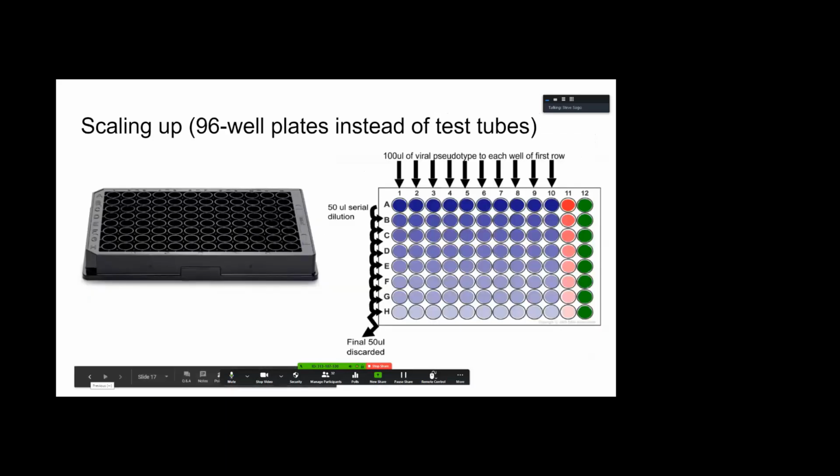So the problem with PCR, as I called it, the old-fashioned way, is it's way too slow. It's too labor-intensive. One person pipetting for one sample is too slow. So the modern way this is done is with these replaced test tubes. So this is a 96 well plate, 8 by 12 is 96. You could say this is patient 1, 2, 3, 4, 5, 6, 7, 8, 9, 10. You get a lot of patients all at once in one 96 well plate. Usually though, you have to do controls. So those of you who have been working on the biofilm project know all about plates and controls.